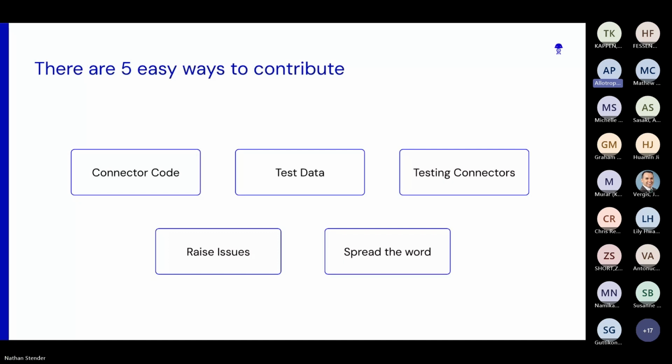You can give us test data. This has been a common theme that I've heard, when trying to develop the ASM schemas as well. One of the hardest things of this is getting examples of the instrument outputs from certain vendors, or just getting different examples for the ones we already have. If you have test files that you can share and you would like to see supported in Allotropy, you can open a GitHub issue against the repo and upload them. Obviously, at Benchling, what we're working on is determined by customer needs, but it is an open source repo, and sometimes I get bored on Saturdays, so we will get to it eventually.